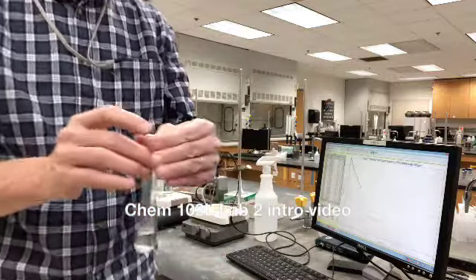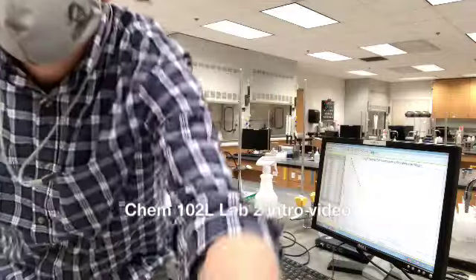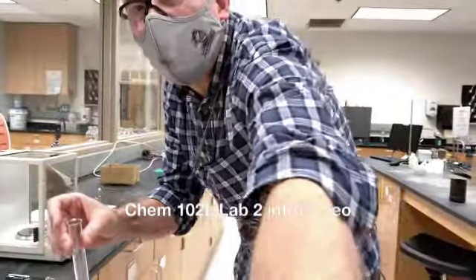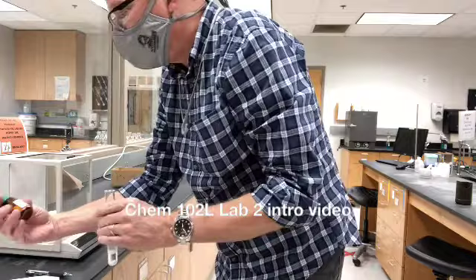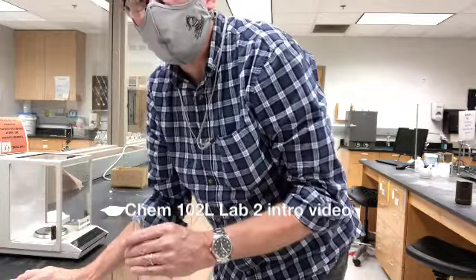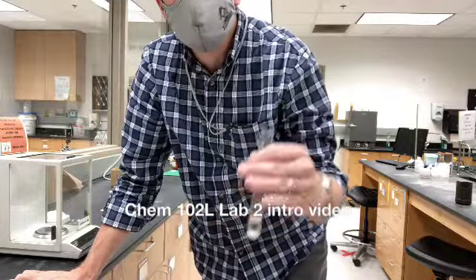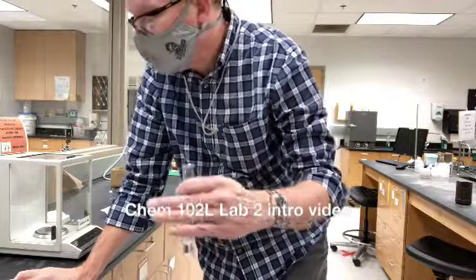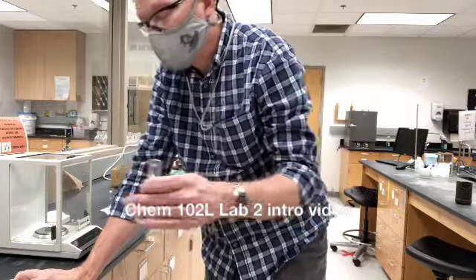Now I want to demonstrate for you how to add the solute using our balances. So this is the same kind of process we had before, which is I want to add some of this unknown. For unknown A, it tells me I want around 0.8 grams. Now, the more mass you put in, the larger the freezing point depression is, but our recommendation is around 0.8 grams to get a good result.